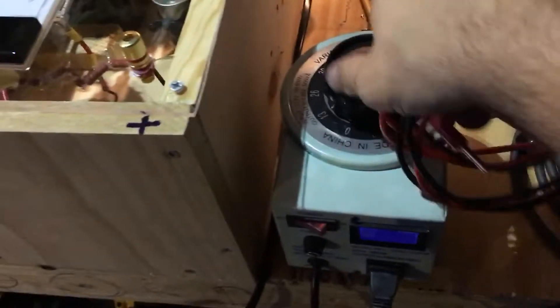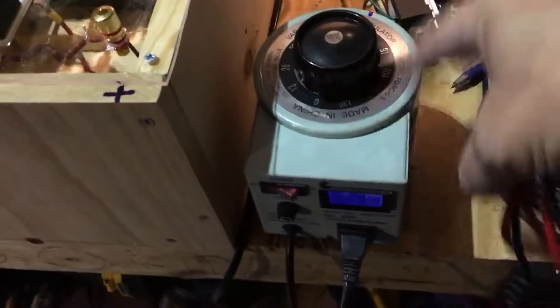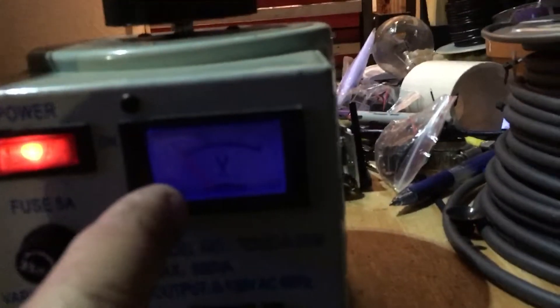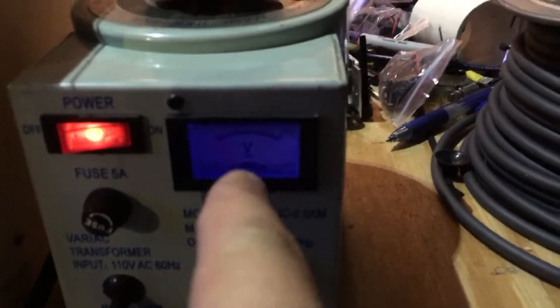Keep the Variac on zero when you turn it on, all the way counterclockwise. Turn it on. You'll be able to get a volts output in here, so it should fiddle with it. All right, the volts goes up.